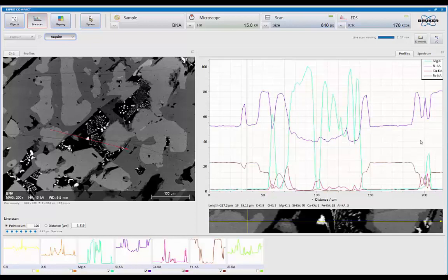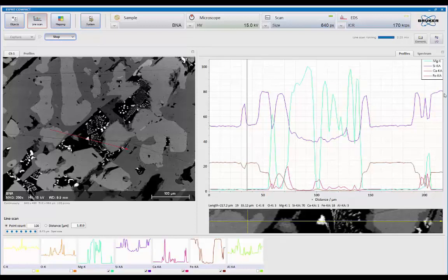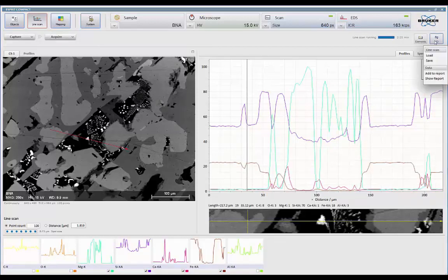When you're finished with this type of analysis, these line profiles can be saved as an Excel file or a straight text file. And grouped together automatically. More importantly, I can then also put this all into a report. So now I can come in here and say, let's add this to the report.